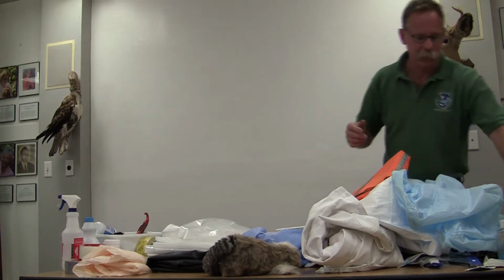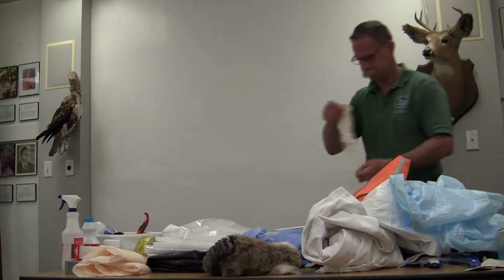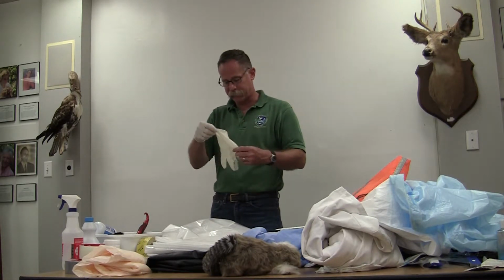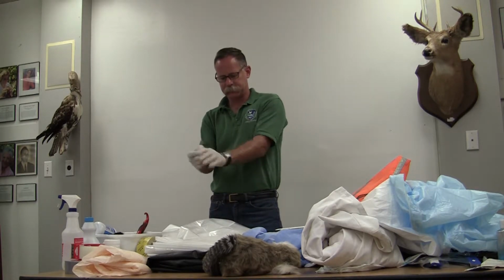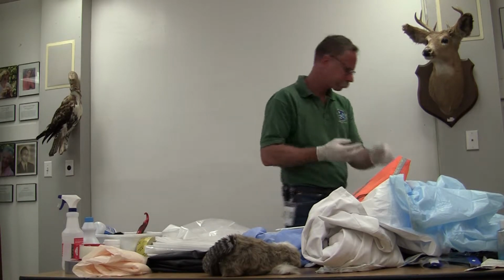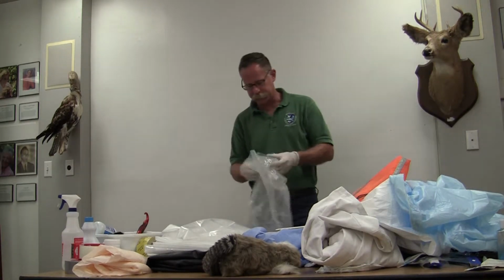So the first thing you want to do is put on a pair of gloves. You're all going to get a chance to try putting gloves on and off when we do our little exercise later, and I'll be watching you like a hawk to point out any mistakes. I've just been reusing these bags, so it's not nicely folded, but I didn't want to waste them.